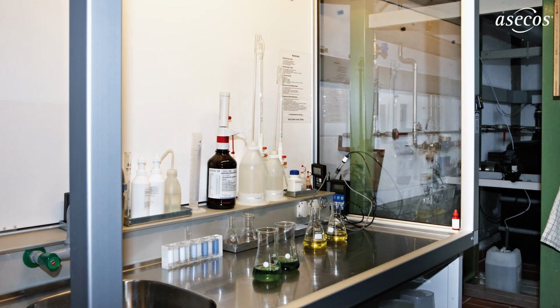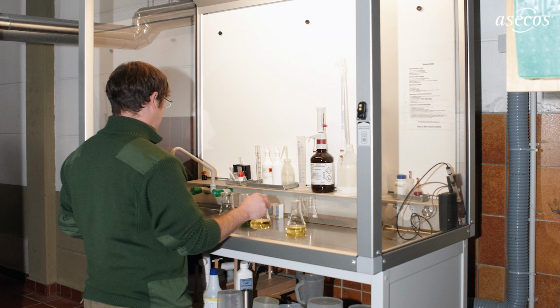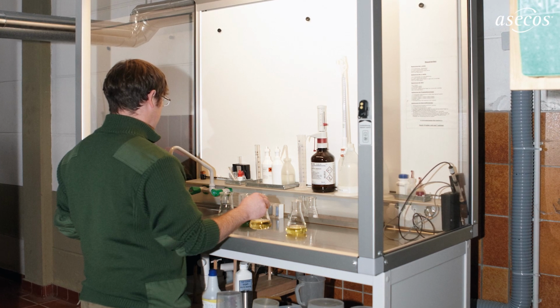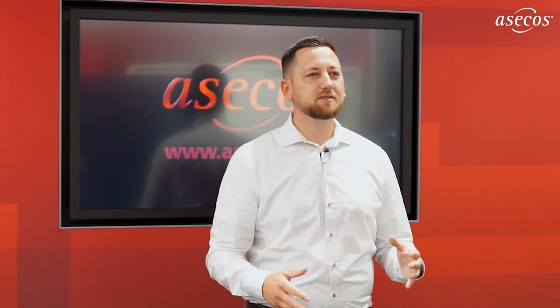And in Landsberg am Lech, a hazardous substance workstation with an underbench cabinet for analyzing water samples is even used in the prison. As you can see, there are virtually no limits to the various applications and uses of asecos hazardous substance workstations.